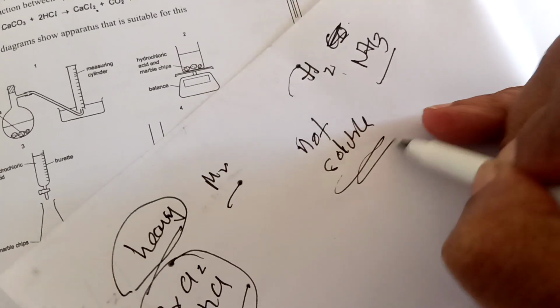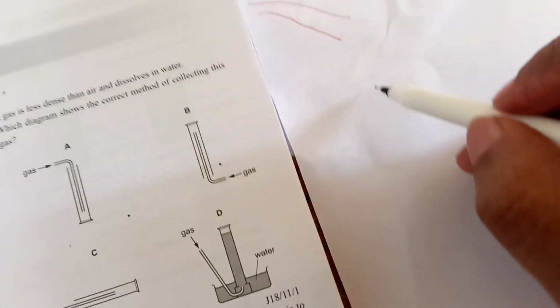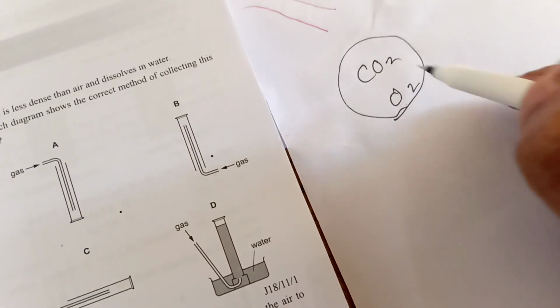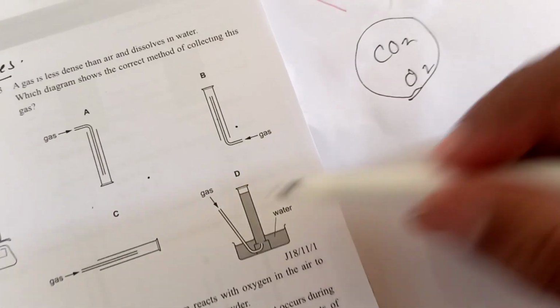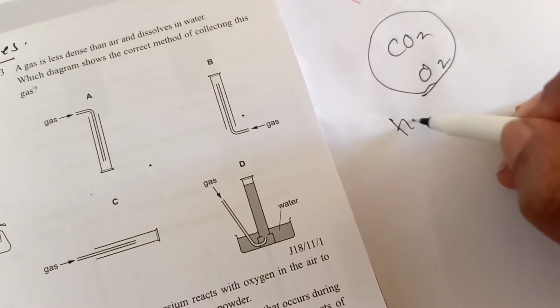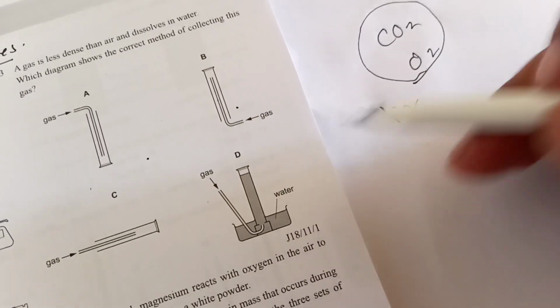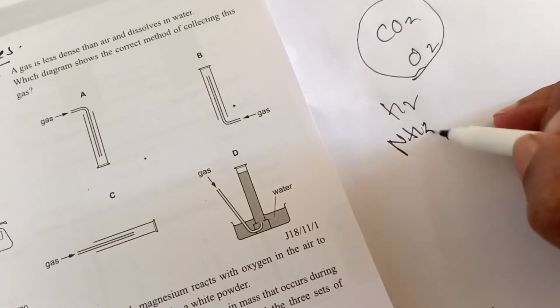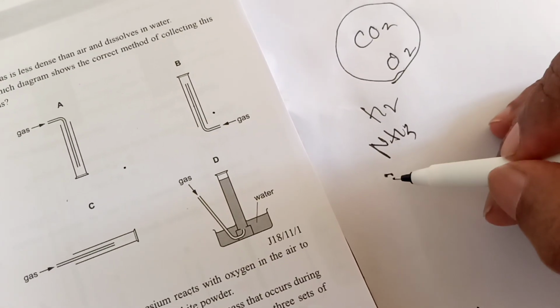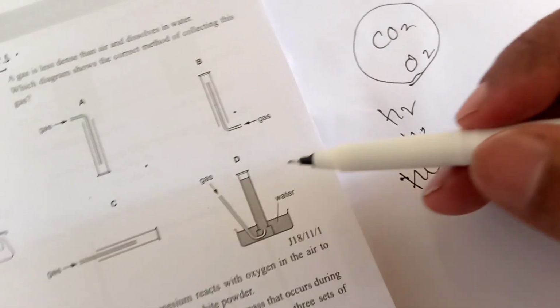If it is, for example, carbon dioxide or oxygen, they are slightly soluble in water, so we can use this apparatus to collect them. Hydrogen also we can collect with this apparatus. But we cannot use it for ammonia because ammonia reacts with water. We cannot use it for hydrogen chloride because it is soluble in water.